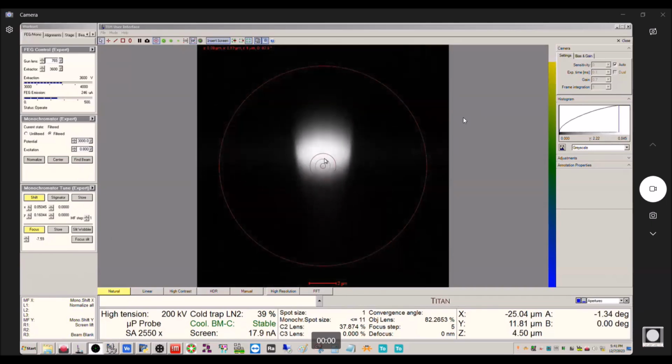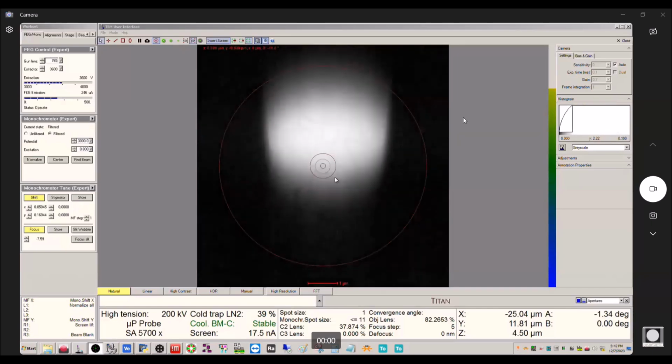now from here, we can work on actually tuning the monochromator. Okay, so we have to stigmate it, which is a little tricky to do. And again, we have OptiMono to kind of help us along the way here. What also is going to happen here as a result of exciting the mono is there's going to be considerable amount of drift in the monochromator.